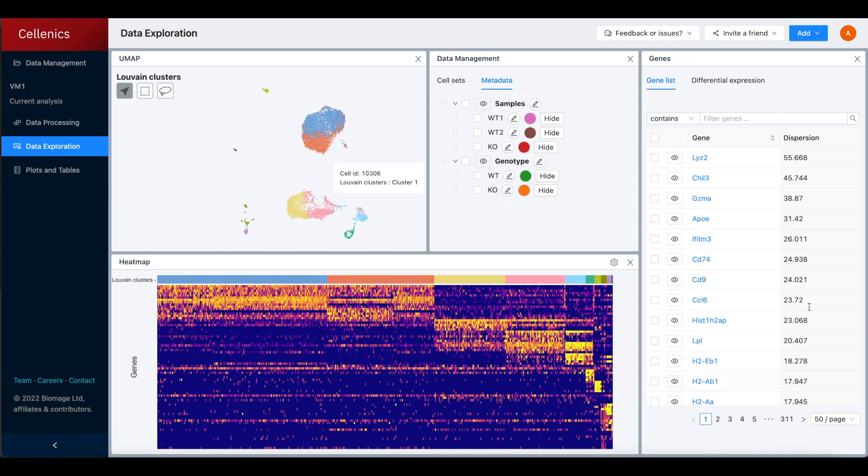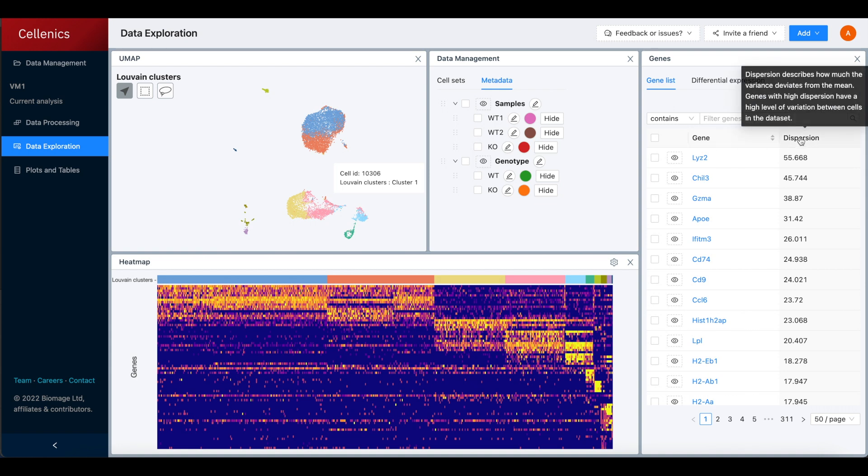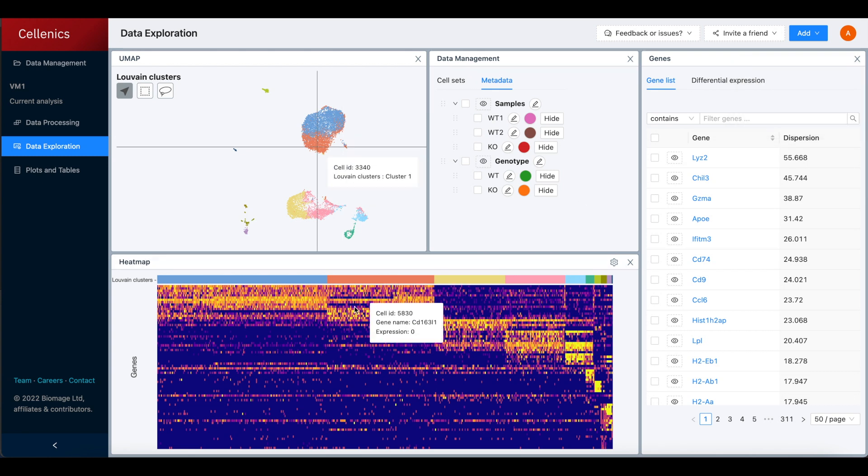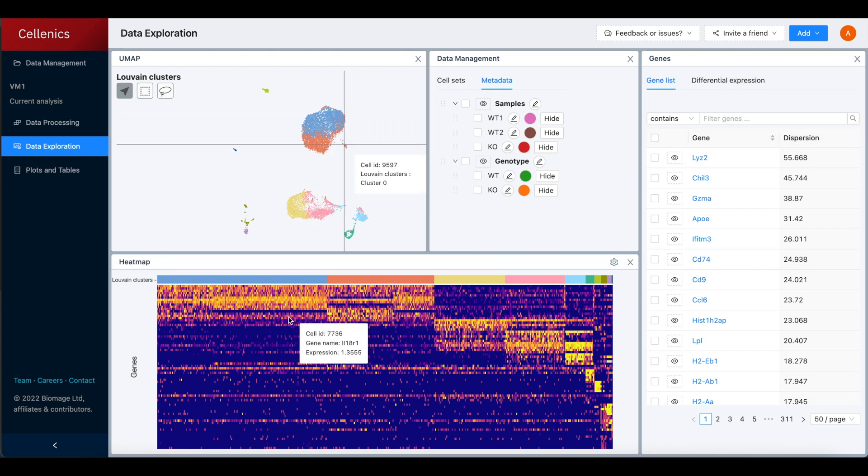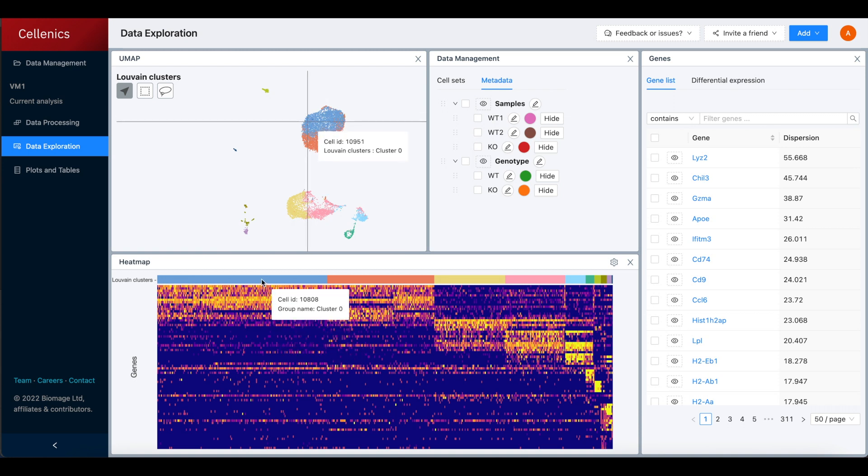On the right, we have the gene list showing the full list of genes present in the dataset ordered by dispersion, which is a measure of variability and expression across the cells. Underneath, a marker heat map for Luvin clusters is shown.